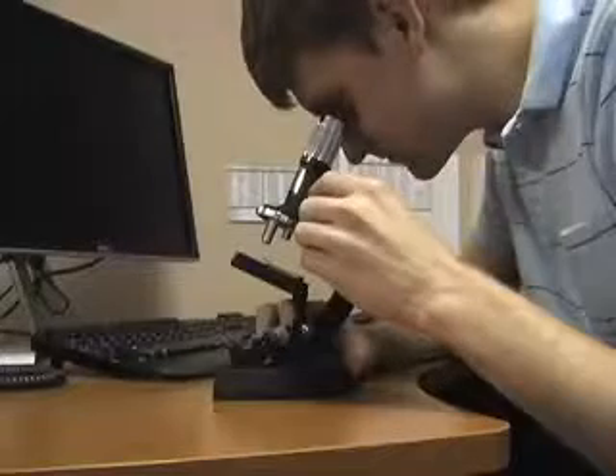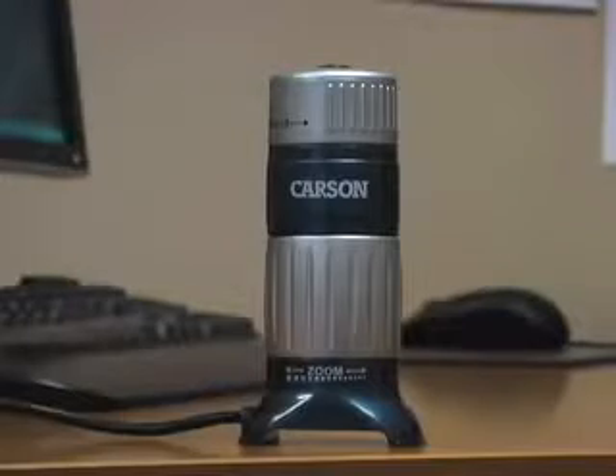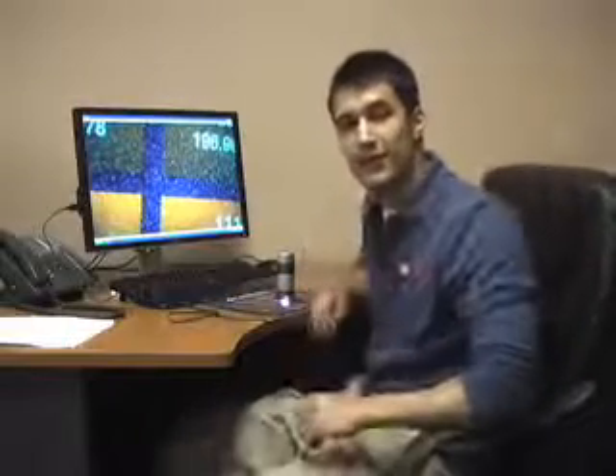Have you ever looked through a microscope and saw something so amazing that you wanted to take a picture or maybe even a video? Well now you can with the Carson Z-Pix. The Carson Z-Pix is a digital zoom microscope with integrated picture and video capabilities that is great for all ages.